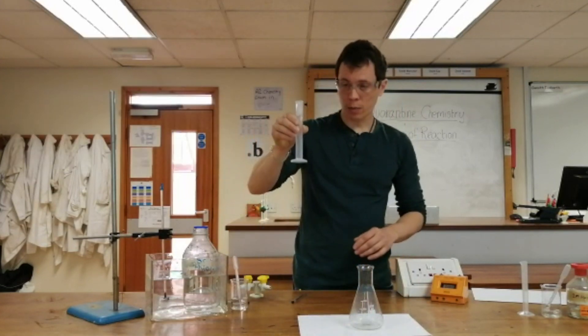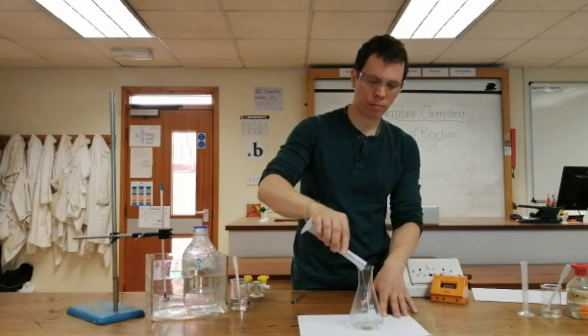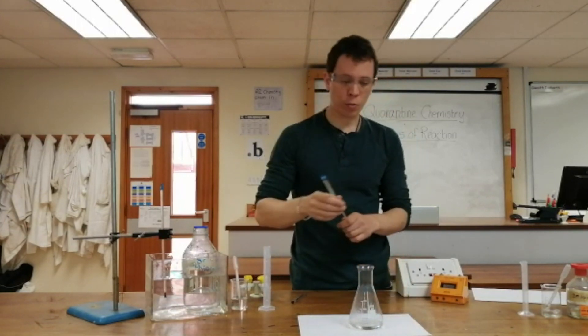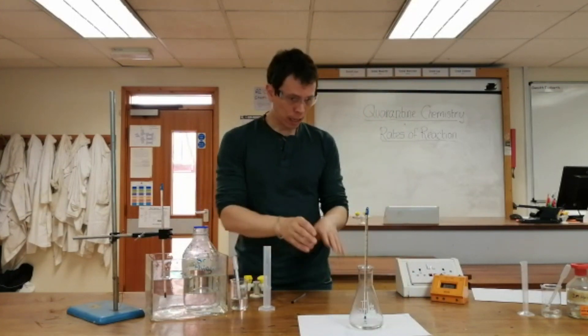I'll pour that in and I'm going to pop my thermometer in just to check the temperature of this. I'll leave that in there for a couple of seconds to get the correct temperature and I'm going to record that in a results table.